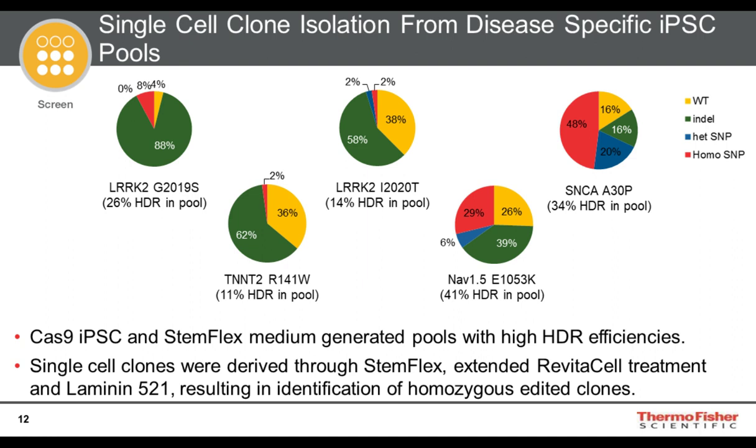And then in all pools, evidently, we are detecting indels still where the homology-driven repair did not occur. And then there's also a number of unedited cells in those clones. And there is some correlation between the overall editing efficiency at a particular target and the total success of indels and/or homology-driven repair.